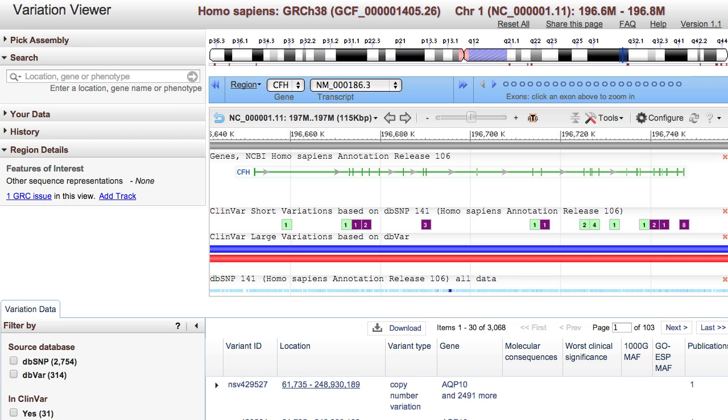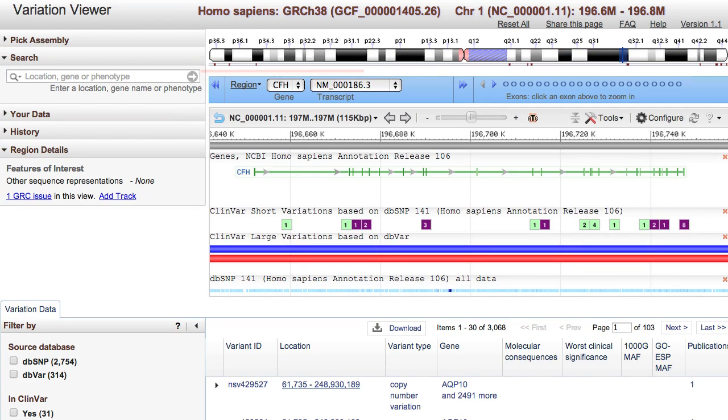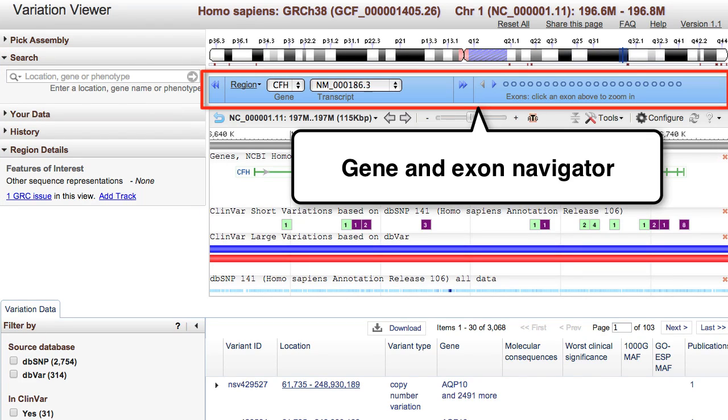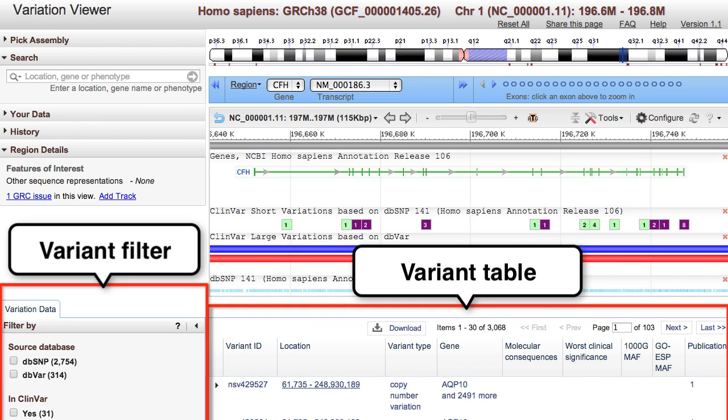The viewer has five general components: Search, the Gene and Exon Navigator, Sequence Viewer, the Variant Table, and Variant Filter.